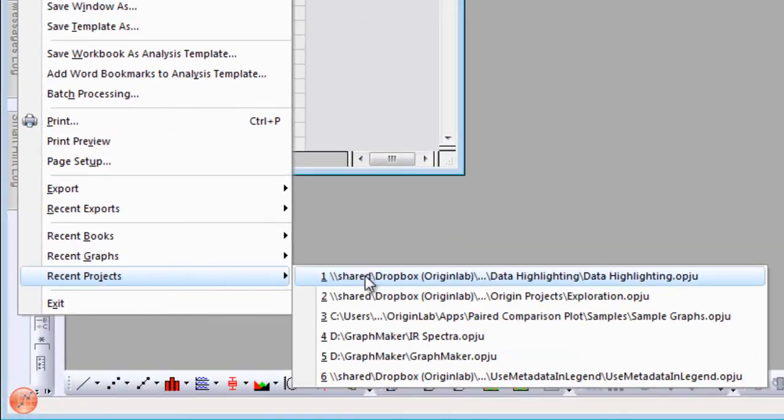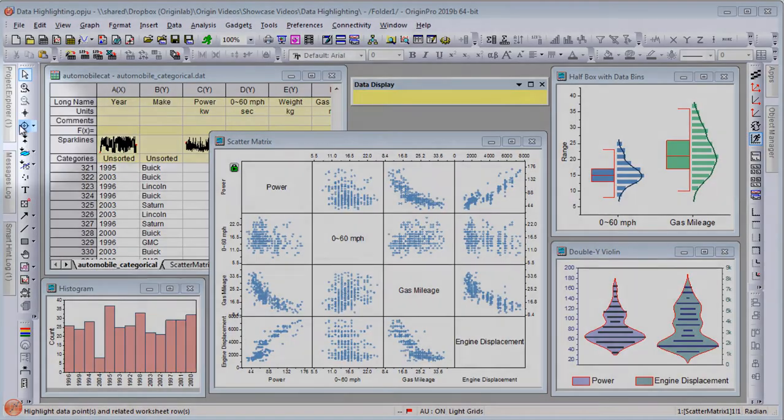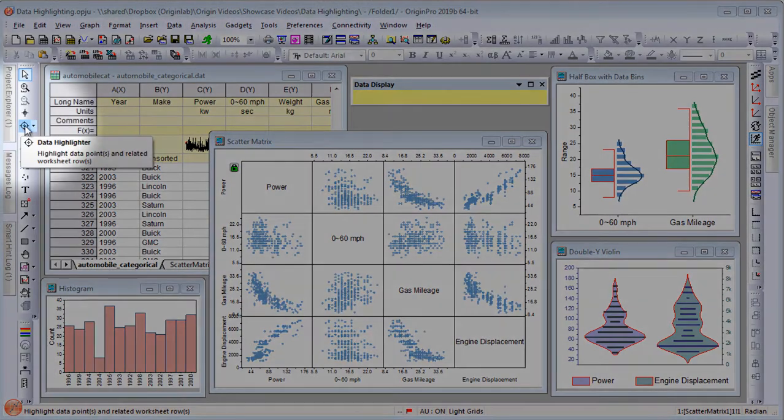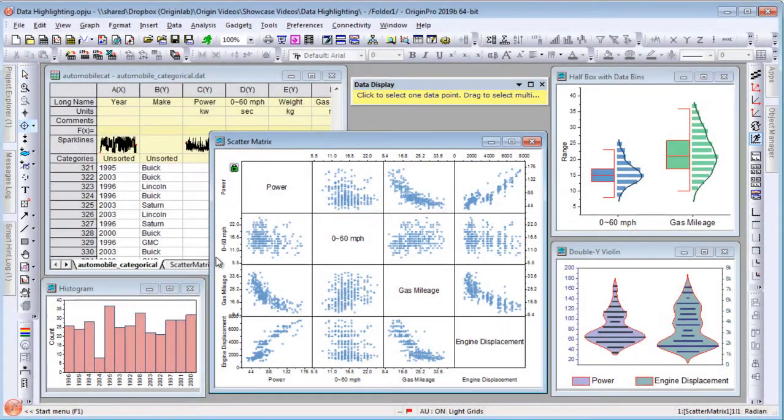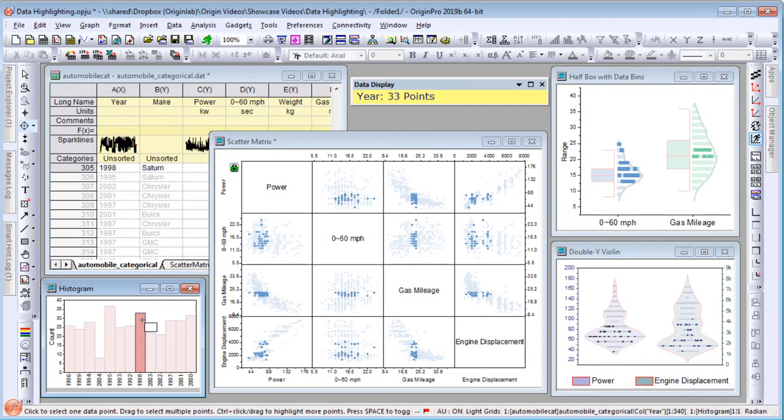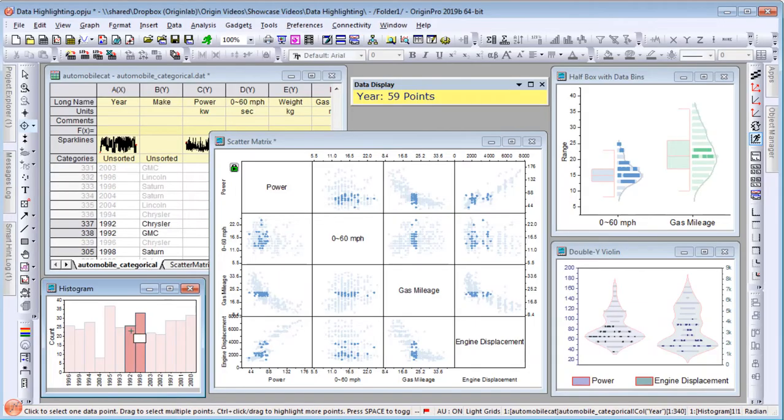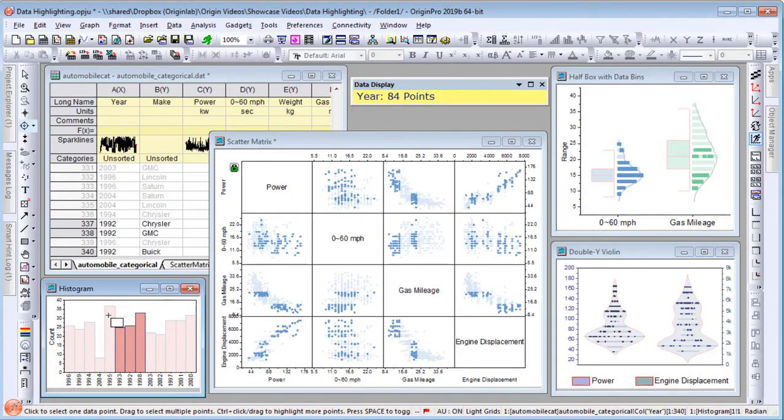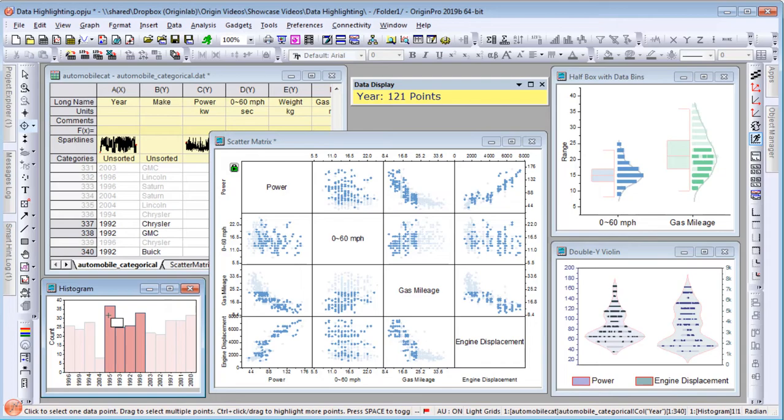Further explore your data using the Data Highlighter tool to select areas of interest in a graph layer. Corresponding data points are highlighted in all other graphs created from the same worksheet.